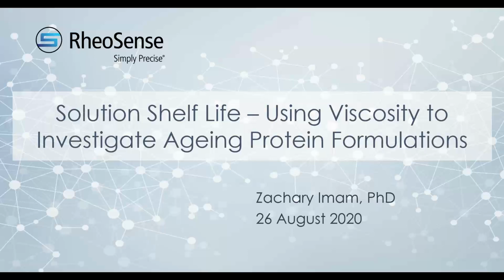The goal for today's webinar is to demonstrate that aging is an important process to understand in formulation science. And since viscosity is a way to measure molecular interactions, we can use viscosity to quantify aging in protein solutions. And stay tuned till the end for some interesting applications data.